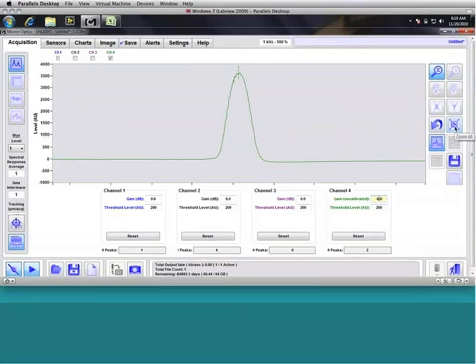Please note the dashed line at the top of the peak. What that is indicating is that the instrument is detecting the peak. You have to make a little bit of a difference between ENLIGHT sensors and the detection on the instrument. So by seeing that dashed line, we're confident that the instrument itself is now detecting that peak.